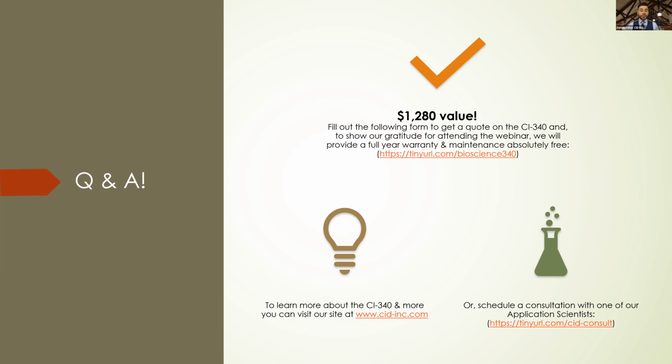The next question is, can we use the LC7, 8, 9, or 10 to make whole plant measurements? Those, if you recall, are the ones that are just a large chamber with the fans inside, and that is definitely the case for those. Normally we created them originally for leaf litter, but quite often they're used for things like whole plants, insects, and, as I mentioned, the coolest one I ran into was a sea cucumber.